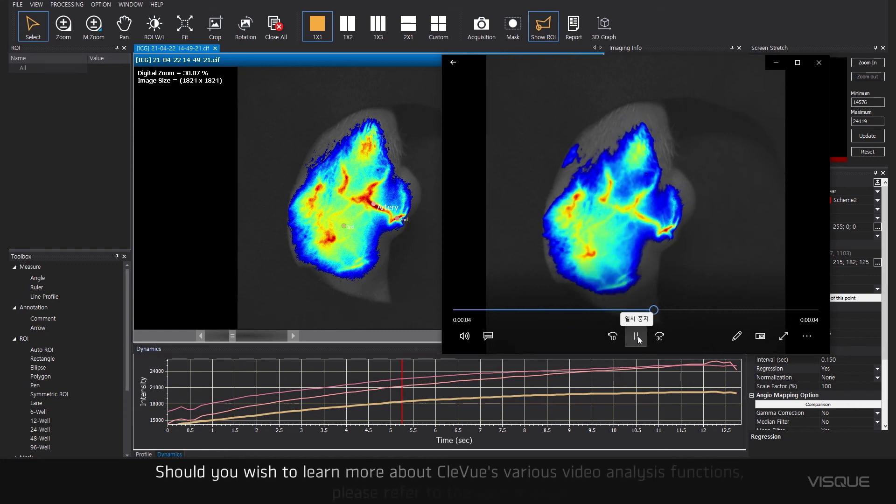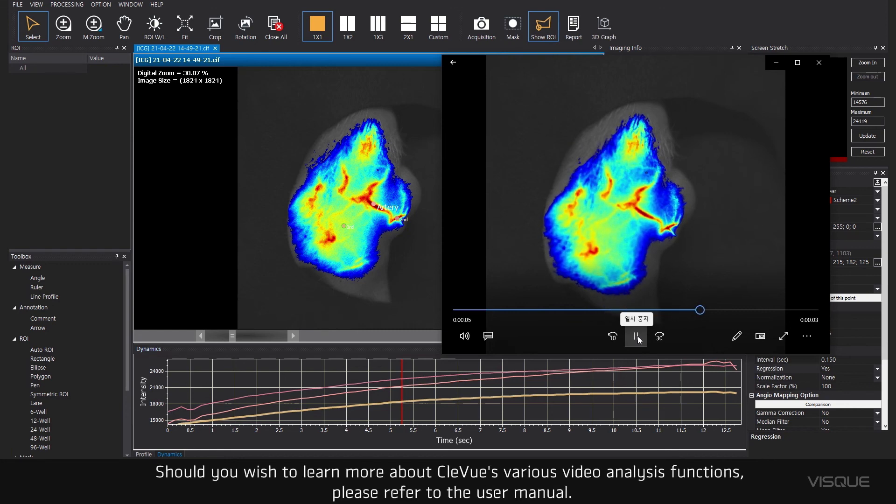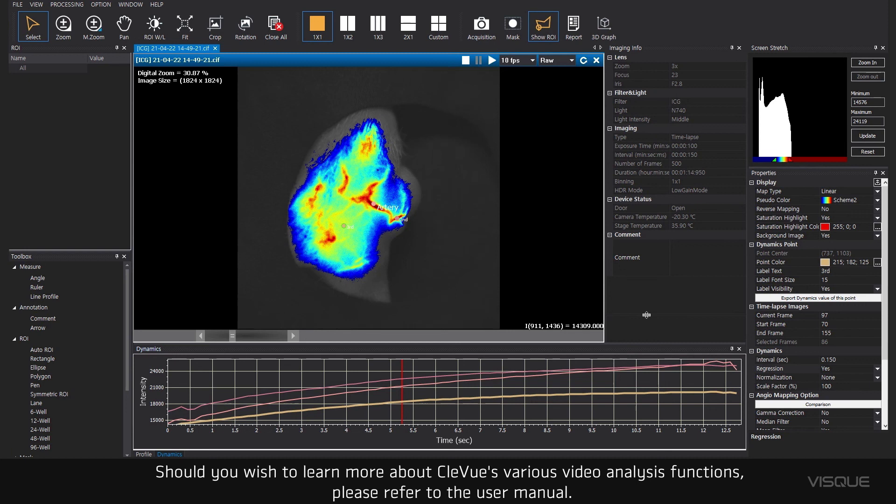Should you wish to learn more about CleVue's various video analysis functions, please refer to the user manual.